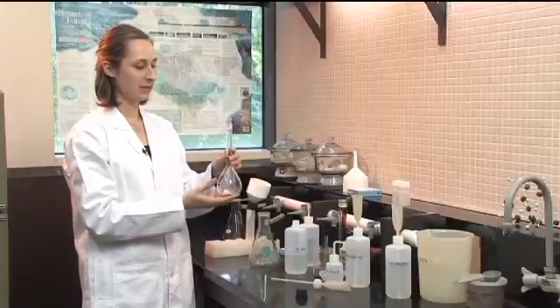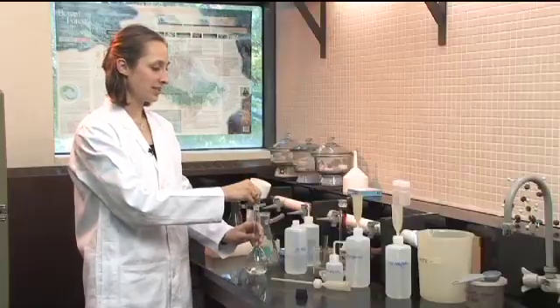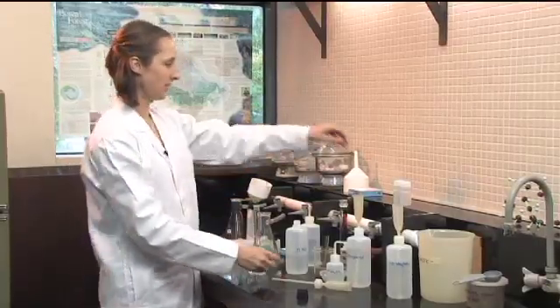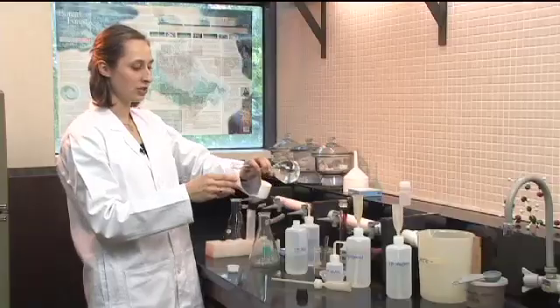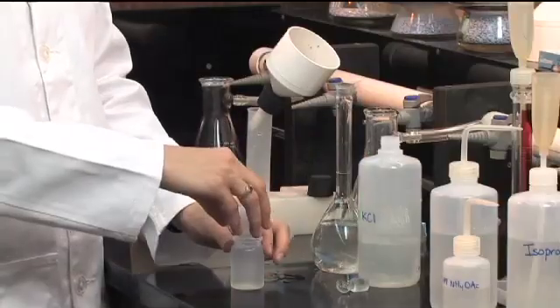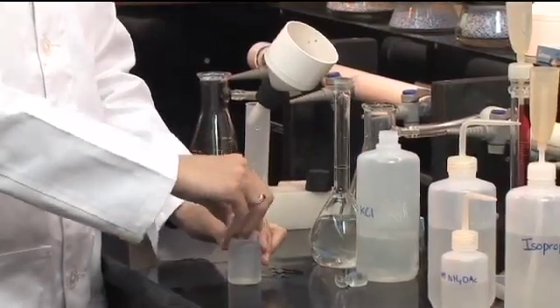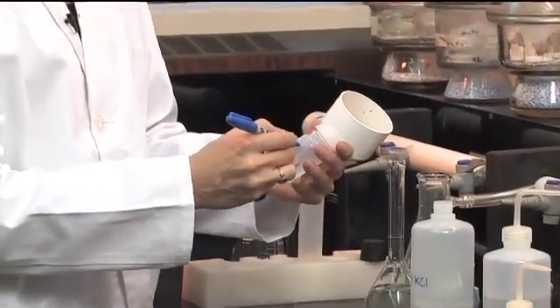Once your solution is mixed, we don't need this much sample to analyze for ammonium. Take a small amount — about 60 ml — and transfer it into a smaller container; that's what we'll send for FIA analysis. That will go straight for analysis or into the fridge. Make sure you label that container with your sample code and the date so you know exactly what is there and are able to trace your samples.